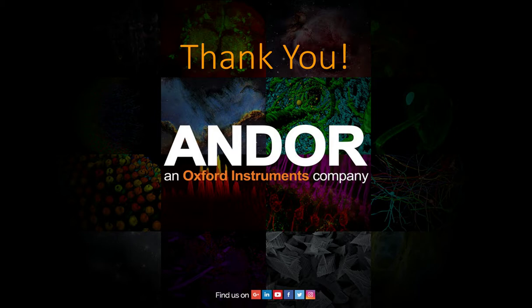Let's start with this one. Dr. Florindo, the Dragonfly is a spinning disc. I had the impression that the spinning discs are suitable for live imaging in thin samples, but not that good for thick sample imaging. Could you comment on this?